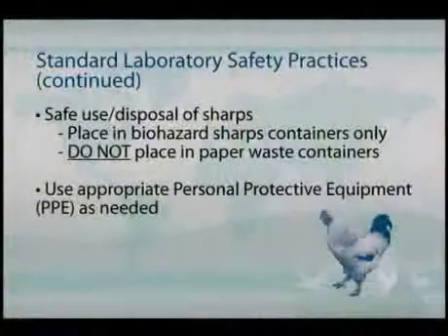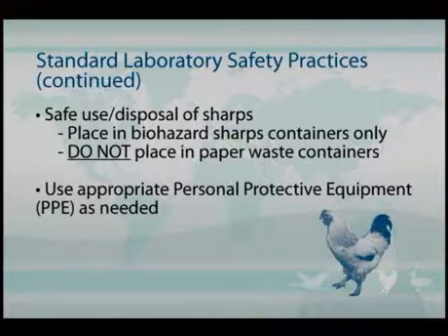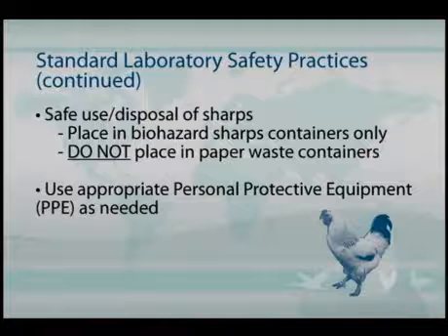Now, also in the labs that we'll be doing this week, we will be using some sharps, and we do ask that these sharps be placed only in the biohazard sharps container. We do not want any of these materials in waste baskets that, if picked up by some unsuspecting person to discard, could result in a puncture or injury.